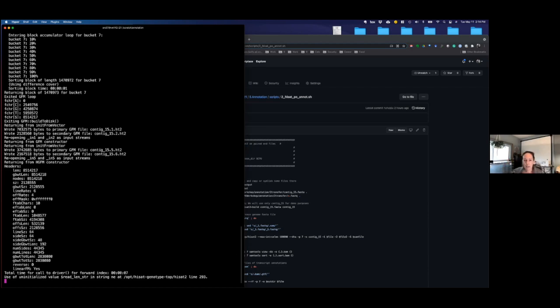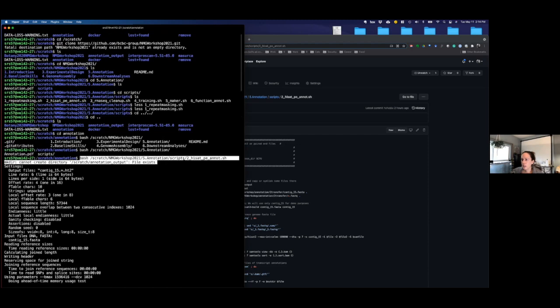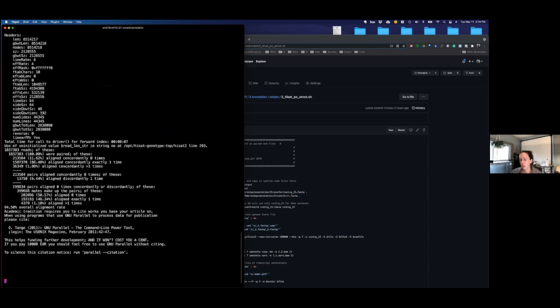Actually, scratch that. I'm confusing myself. It doesn't matter where you are when you run it, so you can just run it like that. There's a space after bash. And I think regardless of where you run this, the files should end up where they're supposed to be.